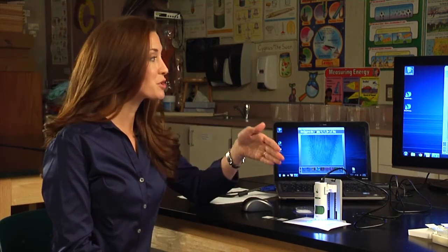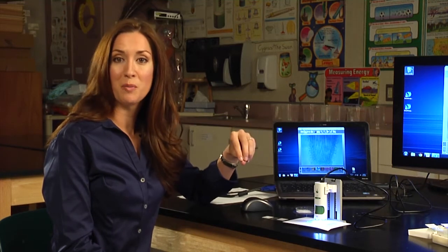Hi, I'm Shannon here for a quick overview on the SmartScope 500. This is a great tool for any classroom. The SmartScope 500 has a fixed magnification of 500X and teachers are using this to show students what they should be looking for in their traditional microscopes.